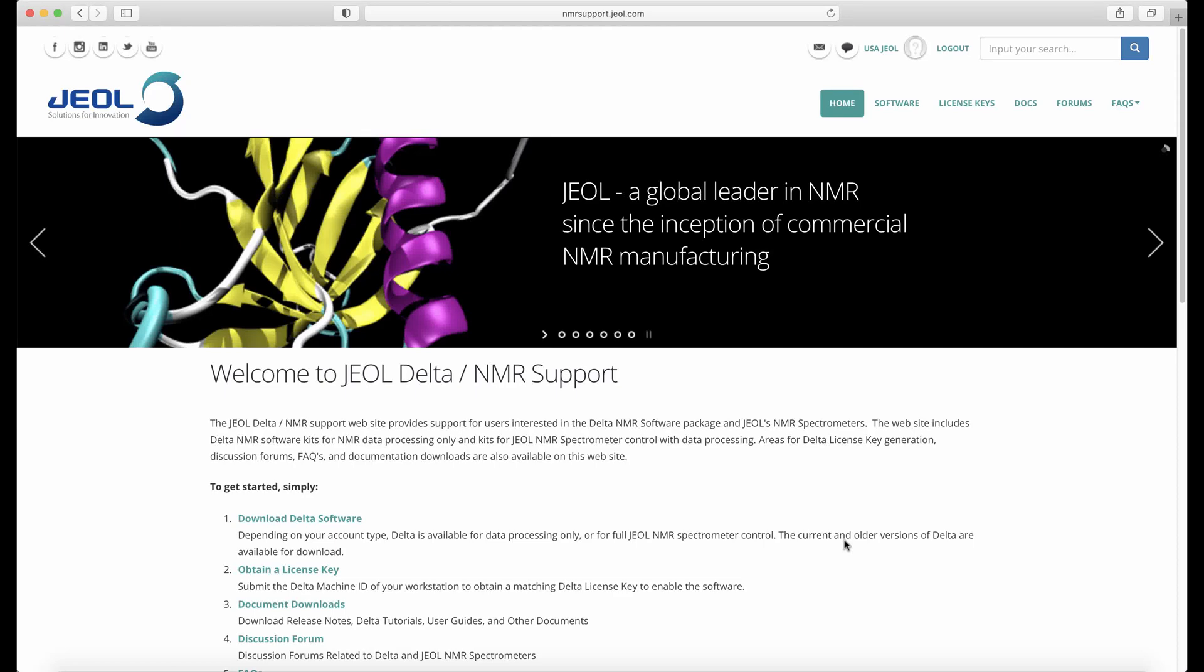Once your account on the NMR support website has been approved, you'll be able to generate a permanent license key for data processing.